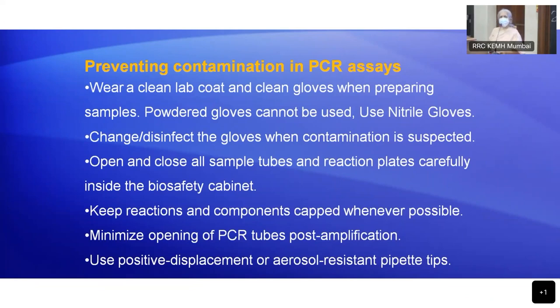Then gloves also. If there is a policy in the lab that after every 10 samples, irrespective of any visible contamination, you change the pair of gloves. But that doesn't always work in a busy lab, right? You don't have the time, etc. But at least when you see residual contamination, stop, pause, remove, change it to a new one, and then you proceed. Just don't proceed like that.